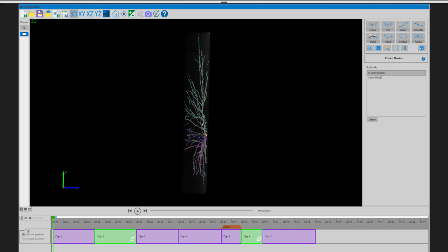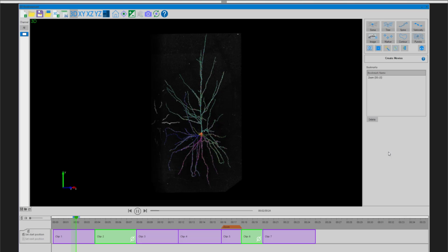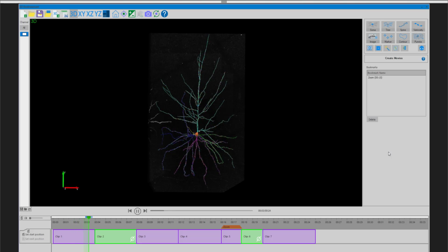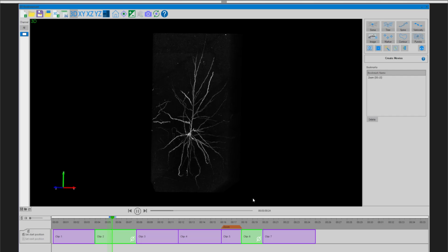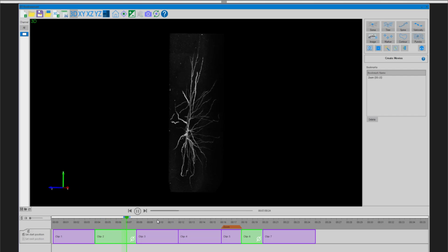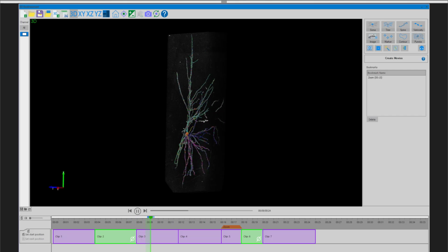Just to give a quick glimpse of what that would look like, let me get that for you. I guess we can just run through right here. Essentially what it would look like is as we're rotating, it will go to our hidden, it will go through, and then it will continue to move along this way. And it will continue to do the movements. Let's see.